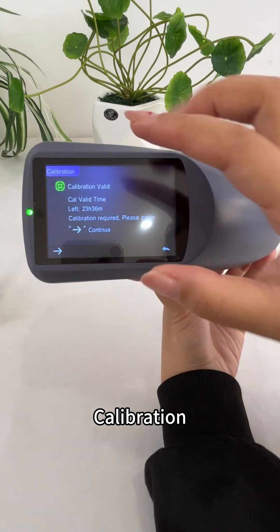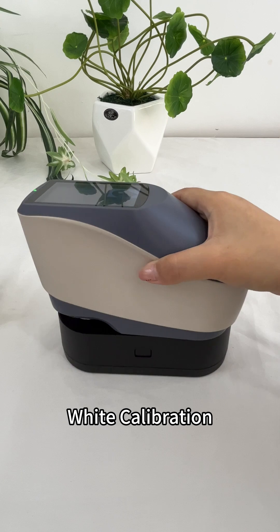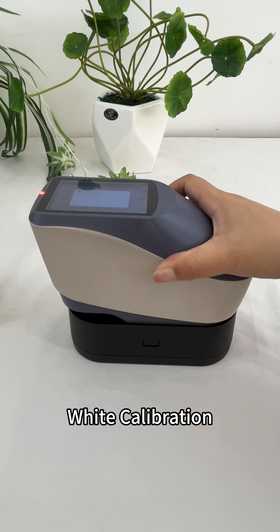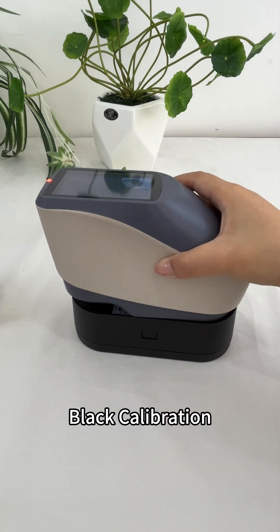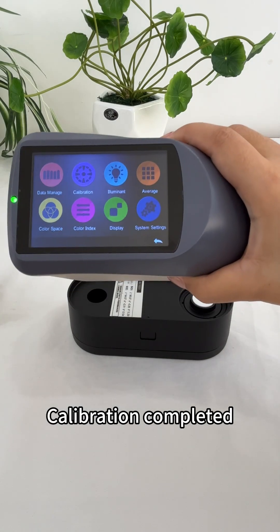Calibration. Perform white calibration, then black calibration. Calibration completed.